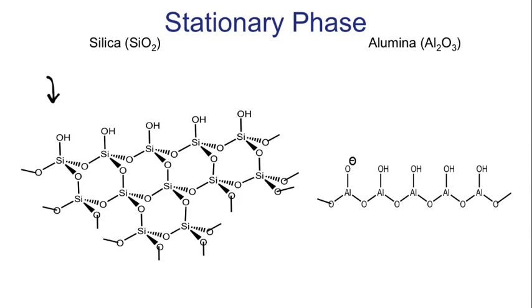So what is on the surface? Well, we can go through and highlight what's up there. We're looking at an awful lot of oxygens. In this case, we've got some hydrogens up there too. Okay. Well, what does that tell us? Well, we've got an oxygen-hydrogen bond. Okay. What type of bond is an oxygen-hydrogen bond? That's right, it's a polar covalent bond.